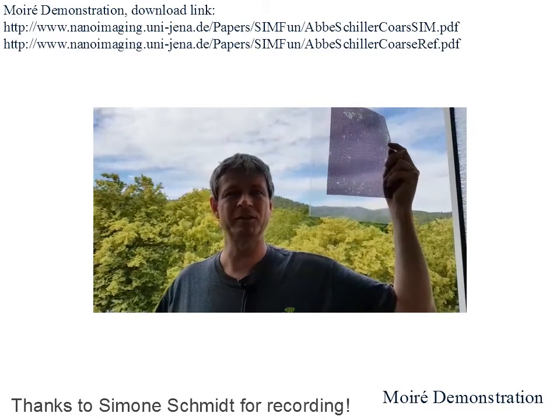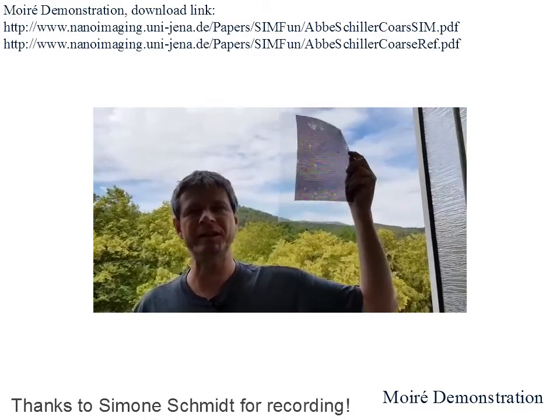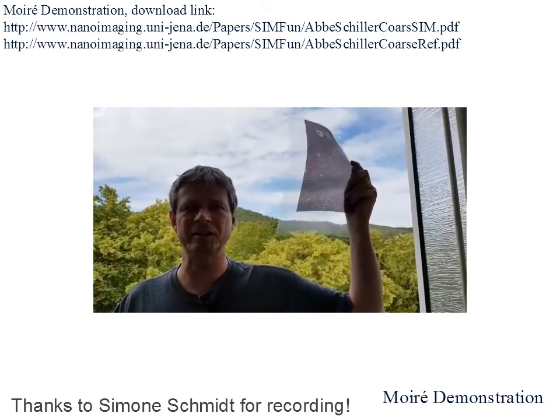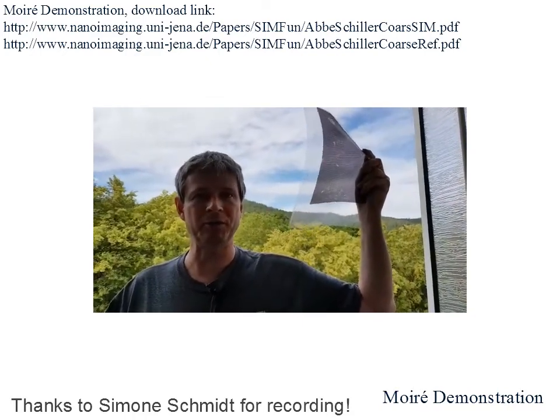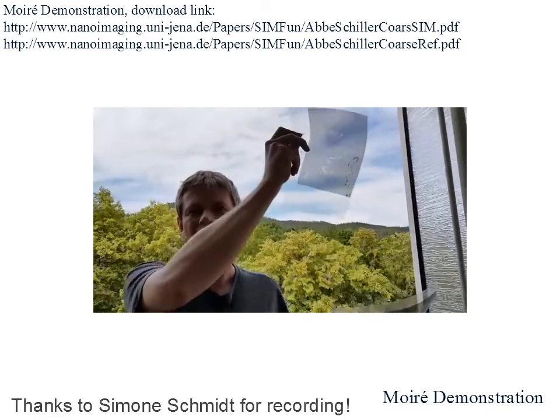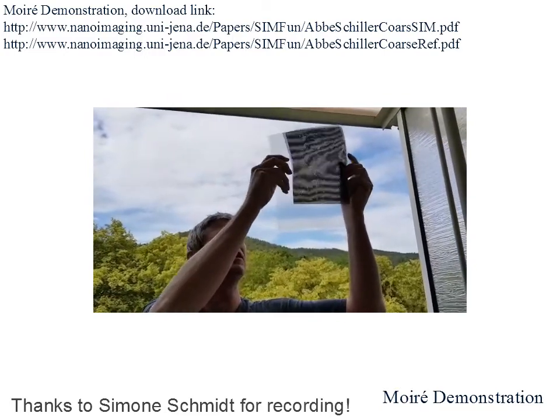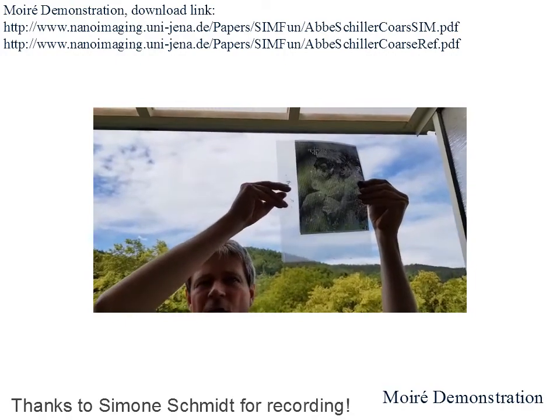Hello, everybody. This is a little demonstration of structured illumination. What you see here in my left hand is a very high frequency pattern. If you're sitting far enough away, you can actually not see the details of this pattern, because your Abbe resolution, the numerical aperture of the eye, is not enough. However, what you see here is another very, very high frequency pattern. And now the magic happens: if I put the two patterns together, like I do here, you suddenly see a clearly low frequency resolved image.